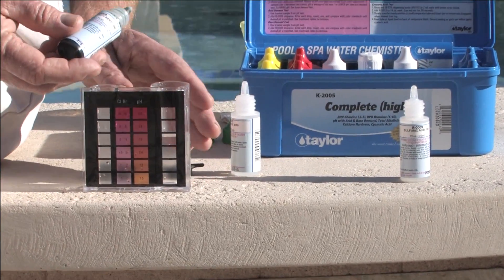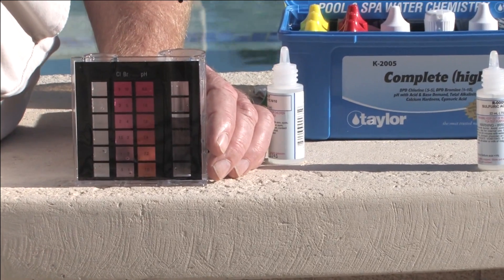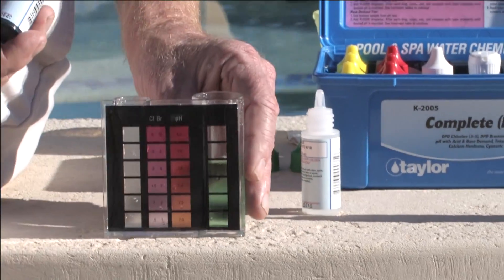Then we'll go for number 8, the reagent indicator, 5 drops. Swirling around. We get a green color, which is appropriate.